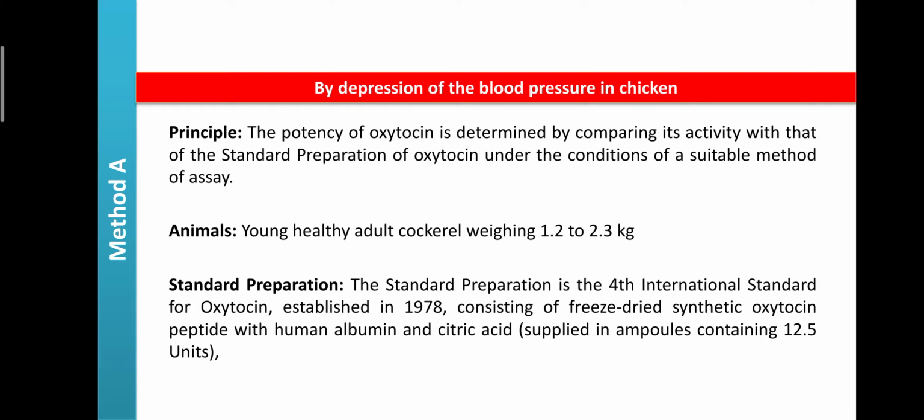And 18 hours before the experiment the animal is fasted. During the experiment the water is withdrawn, because if your animal takes water, urination occurs, and that urine output can enhance the excretion of the drug from the body.